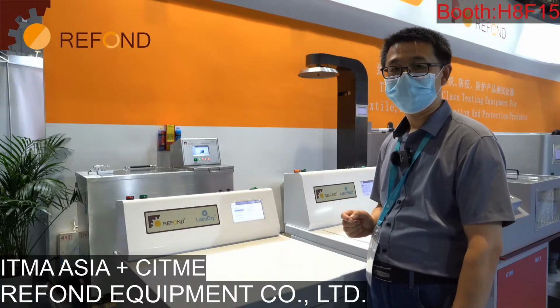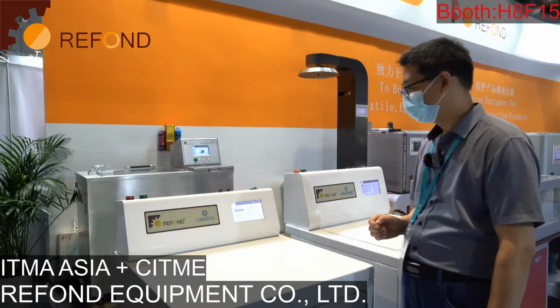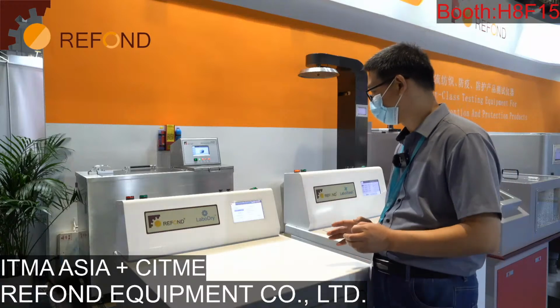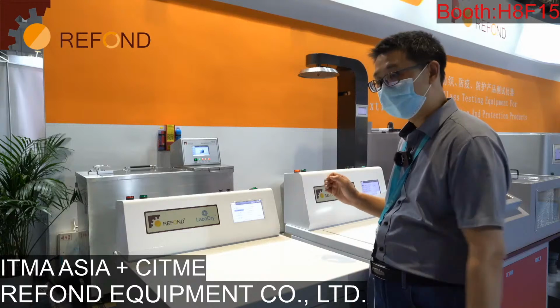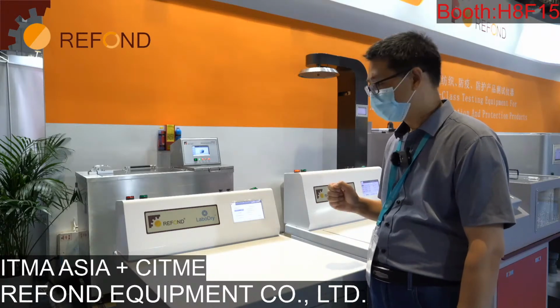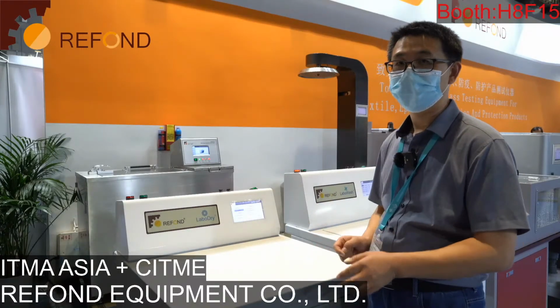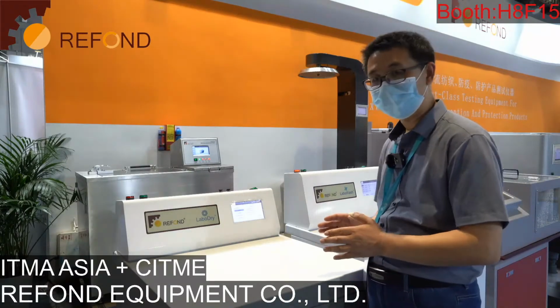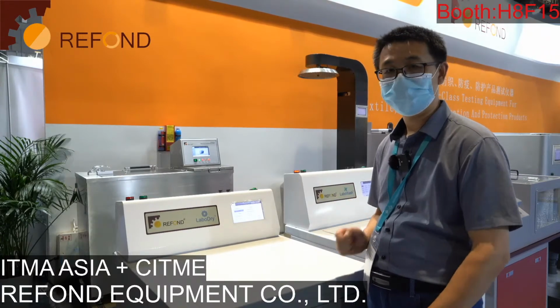You can decide whether the fabric has been dried. So that's the new function. After the customer has the experience, they can decide what is the targeted humidity they want to set. Once they set the targeted humidity, they can control the drying condition of the specimens inside the jar. So it can protect the specimens inside from over drying or less dry.